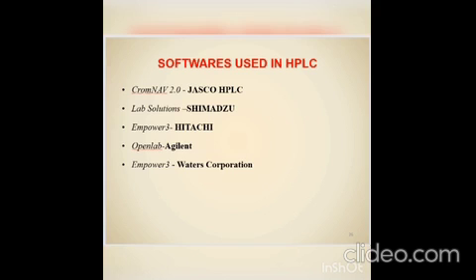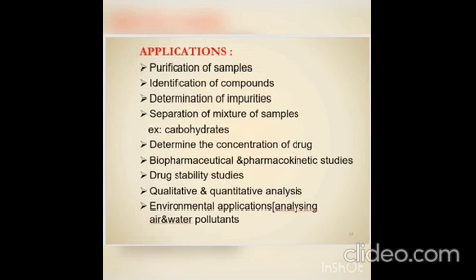Then next, applications of chromatography. Mainly for purification of the sample, identification of compounds, determination of impurities, separation of mixtures of samples, determination of the concentration of the drug, biopharmaceutical and pharmacokinetic studies, drug stability studies, qualitative and quantitative analysis, and next environmental applications like analyzing air, water, and pollutants.